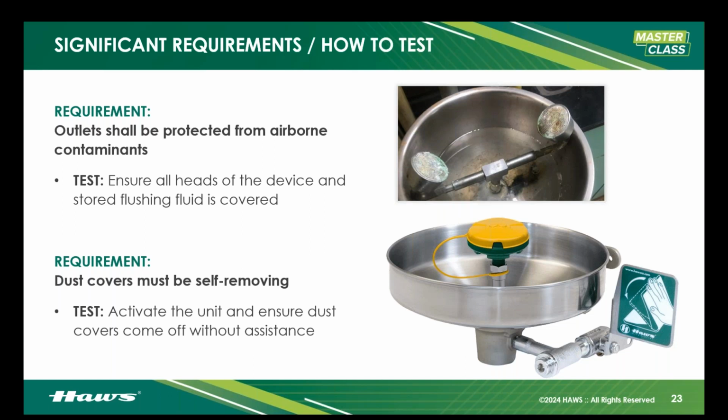Now, the dust covers also have to be self-removing. So on activation of that paddle that you see there, the equipment has to spring to life and remove the dust cover all on its own. Okay, now the paddle can also be the dust cover removal device. You'll see what are called clamshell dust covers that'll flip up as you push the paddle, but it has to be all by itself, self-removing. Okay, if you have to take a separate action to grab it, non-compliant.